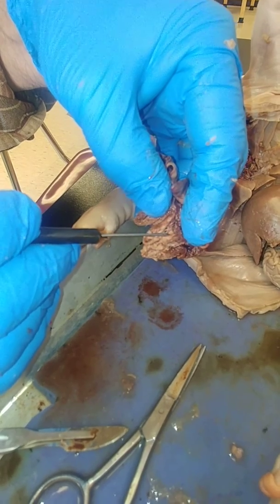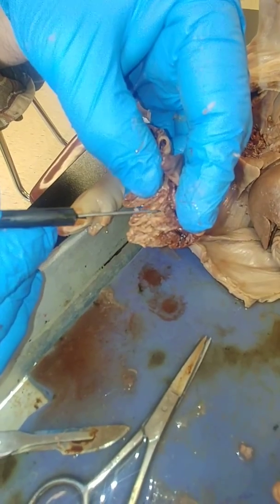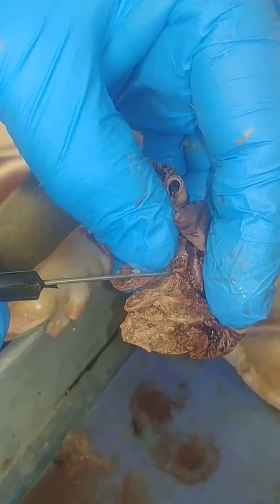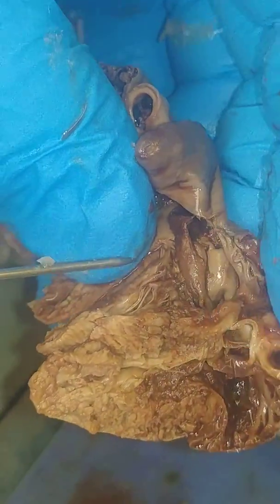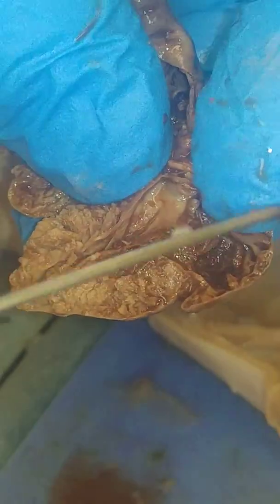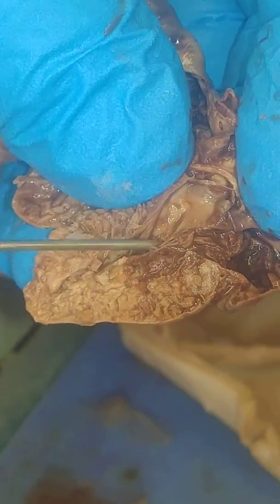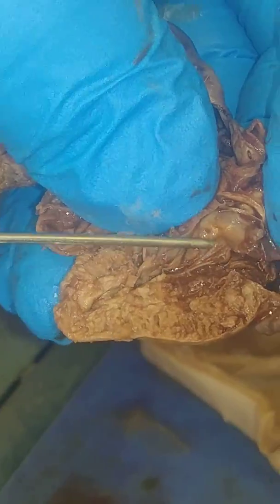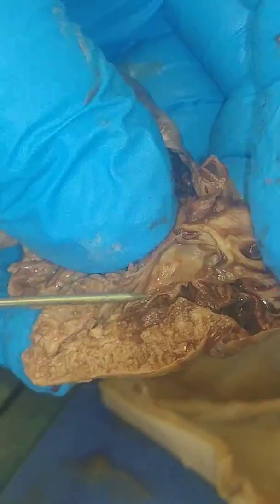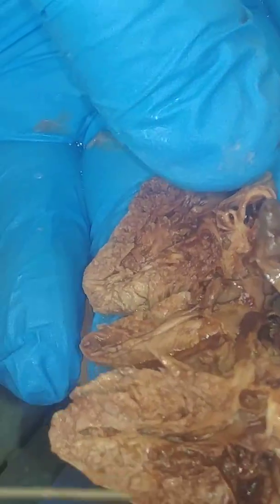Okay, hopefully this comes out here, but this is the valve area. And on the right side, that would be the tricuspid valve. You can see these little bitty strands. Those are called chordae tendineae. They keep that valve from buckling backwards. And then on this side, you would have the bicuspid valve, and this is kind of discolored with all the loose blood that's there, but I can get underneath it there. So just like little flaps, and they've got the same little cords here that are holding that in place. Okay, so that's the inside of the heart.